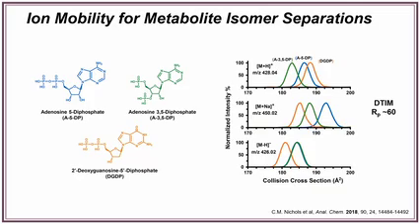So this is a great example of the isomer issue. These are constitutional isomers. They have the same chemical formula, but the structures are different because the functional groups are connected in different places on the molecule. On a typical drift tube ion mobility instrument like the 6560, working at a resolution around 60, you can partially separate these different molecules at certain adducts.